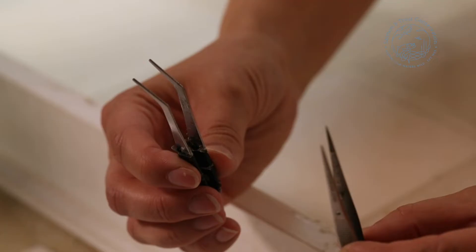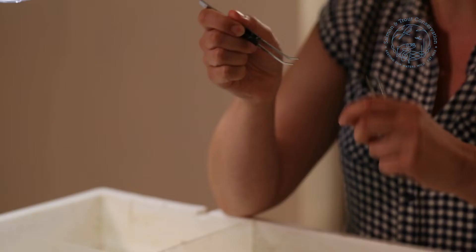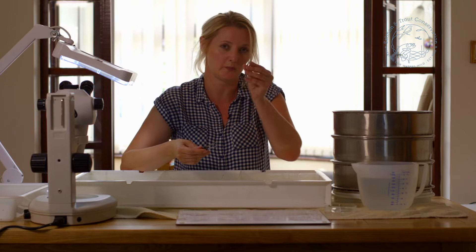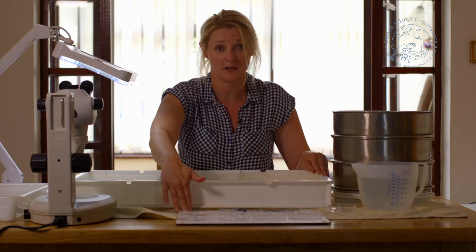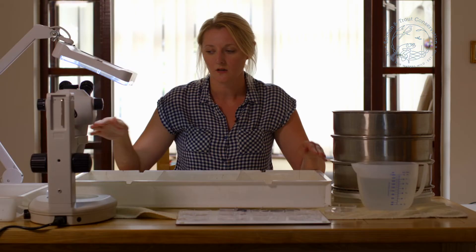I've also got a couple of pairs of tweezers. It is down to your personal preference which you use. I personally prefer these because they've got a bend at the bottom so I can move rocks and various things out of the way as I'm sorting. Other people prefer to use the straight pointed ones. These are put onto a white sheet so that we can see everything clearly.